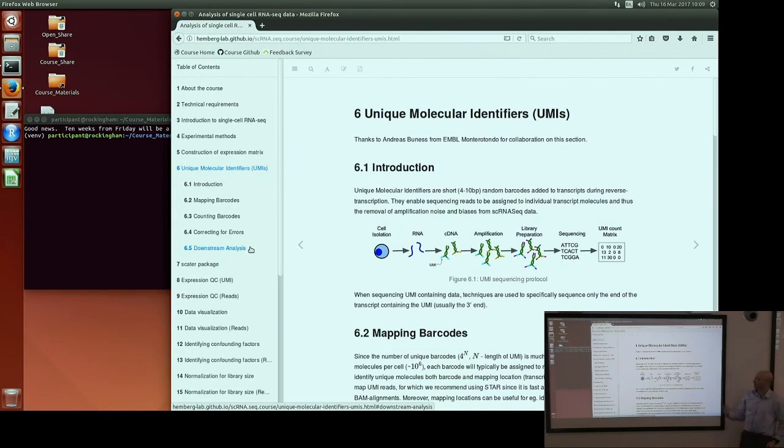The trade-off here again is that, so there are two trade-offs. One is that the shorter your barcode is, the more of the genomic sequence you will be able to read off, which will improve your mapping. Again, with the read lengths that we have today of 100 plus base pairs, sacrificing 5 or 10 base pairs shouldn't make much of a difference in terms of the mappability. So I don't think that's a big difference.